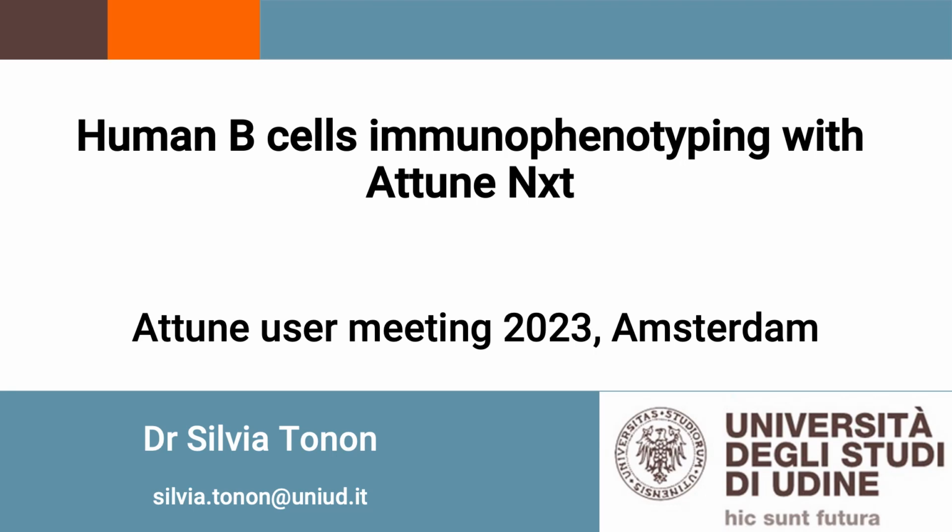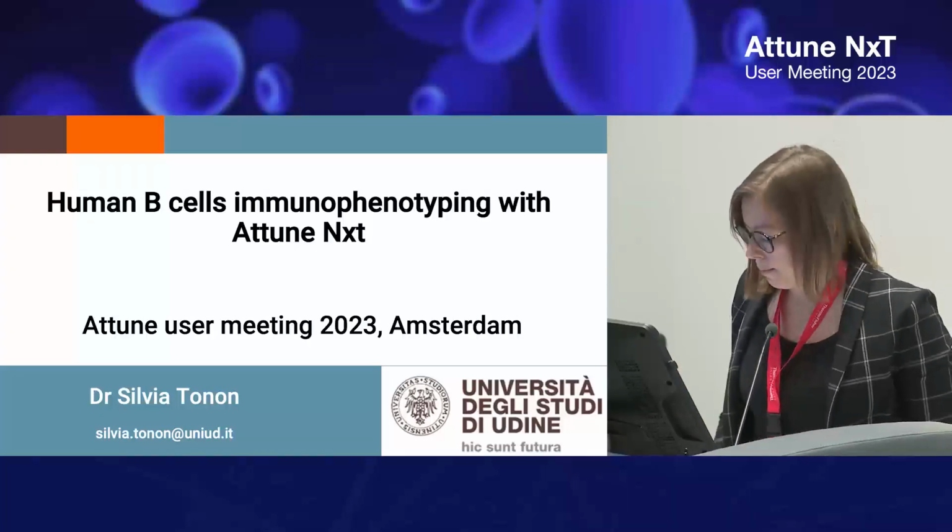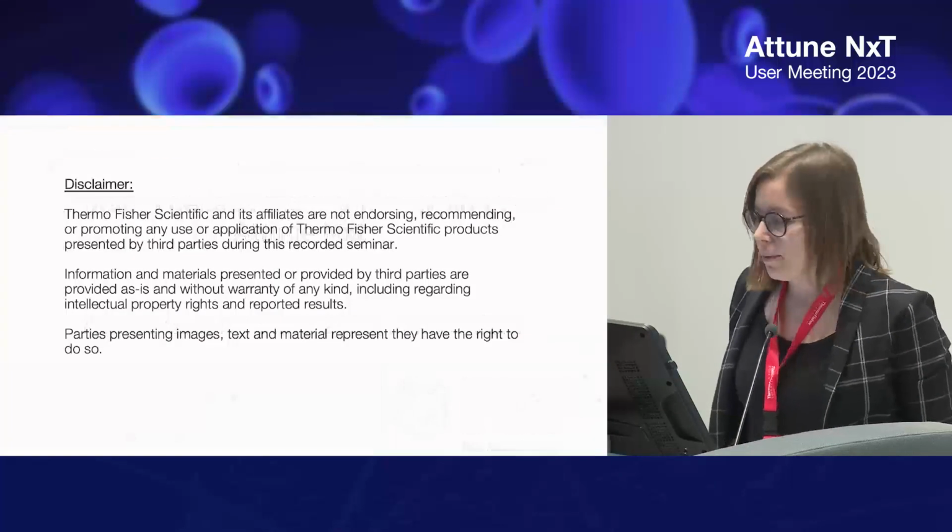We are quite new users of the Attune, and we have the Violet 6 configuration, and today I will talk about some tips to phenotype human B cells.